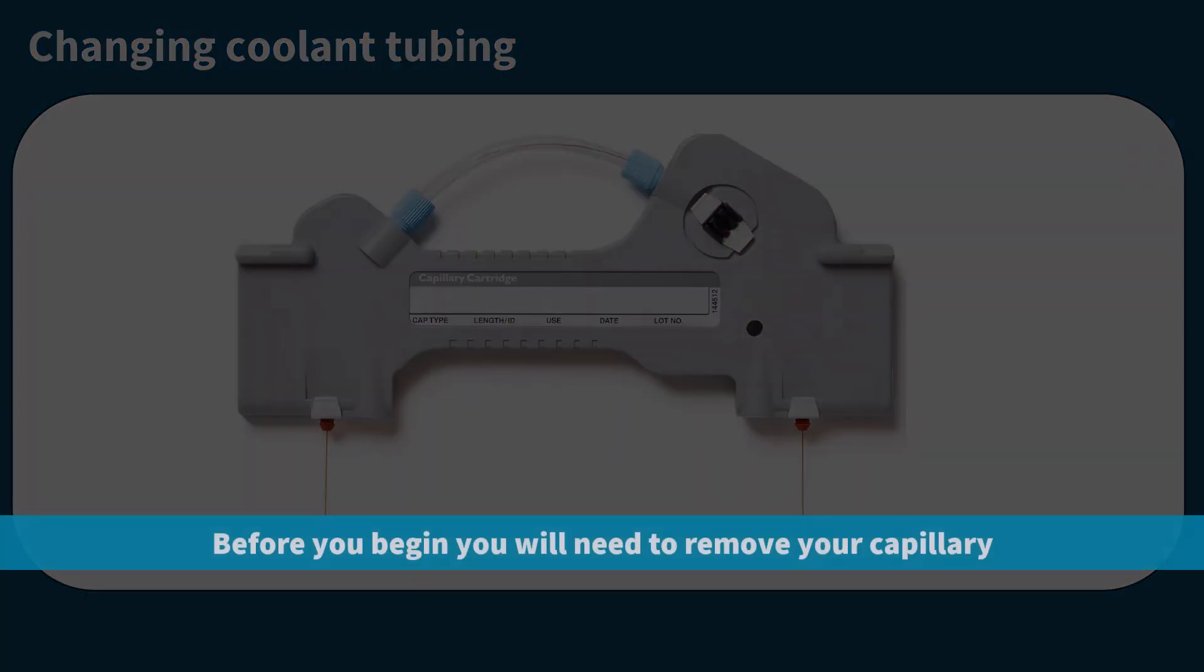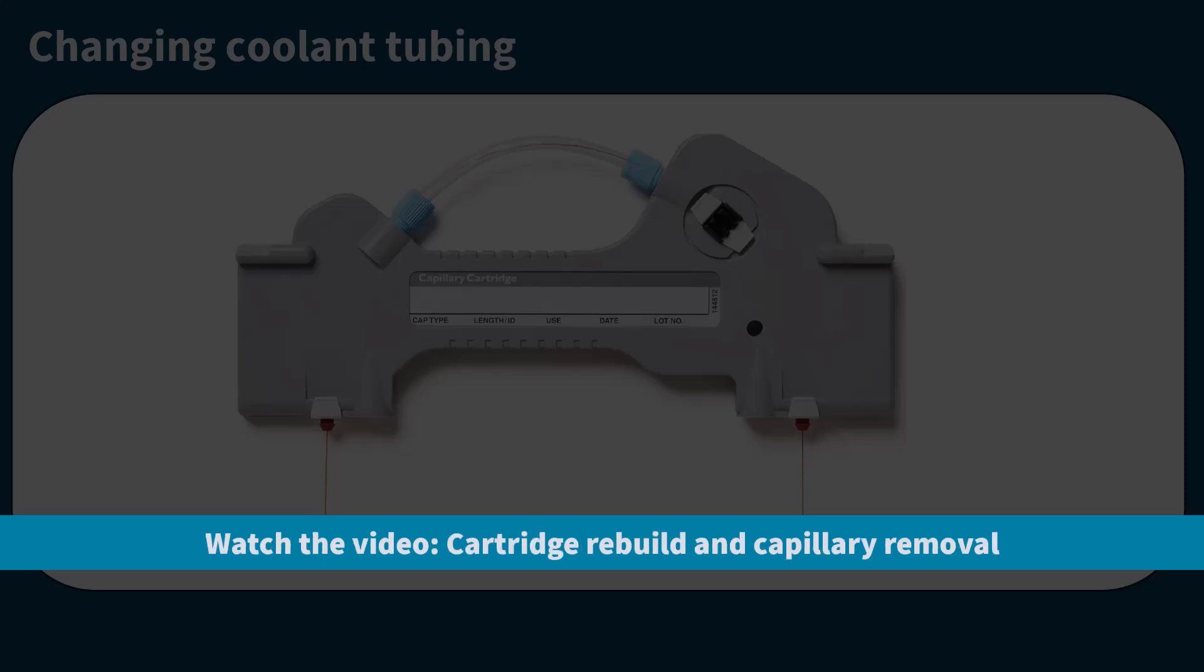Before you begin, you will need to remove your capillary. This is covered in our video titled Cartridge Rebuild and Capillary Removal.